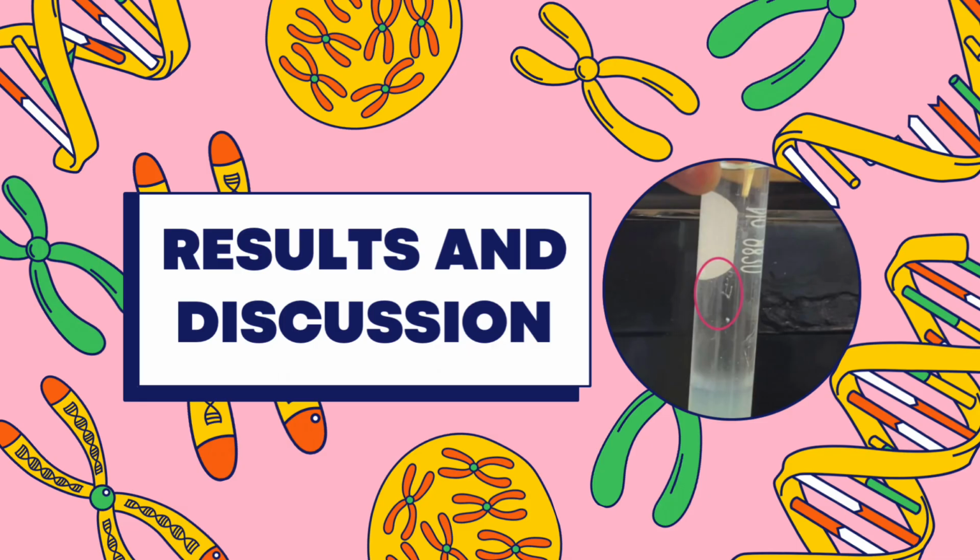Well, the actual results are contrary to our expectations, as upon adding the cold ethanol down the side of the detergent and banana extract solution, we observed the formation of white, stringy, and cloudy clumps. While these clumps did adhere to a wooden stick when swirled, they were not as thick or distinct as anticipated. Instead, they resembled a cloudy liquid with an evident layer that could still be considered DNA. This outcome indicates that DNA was successfully extracted.